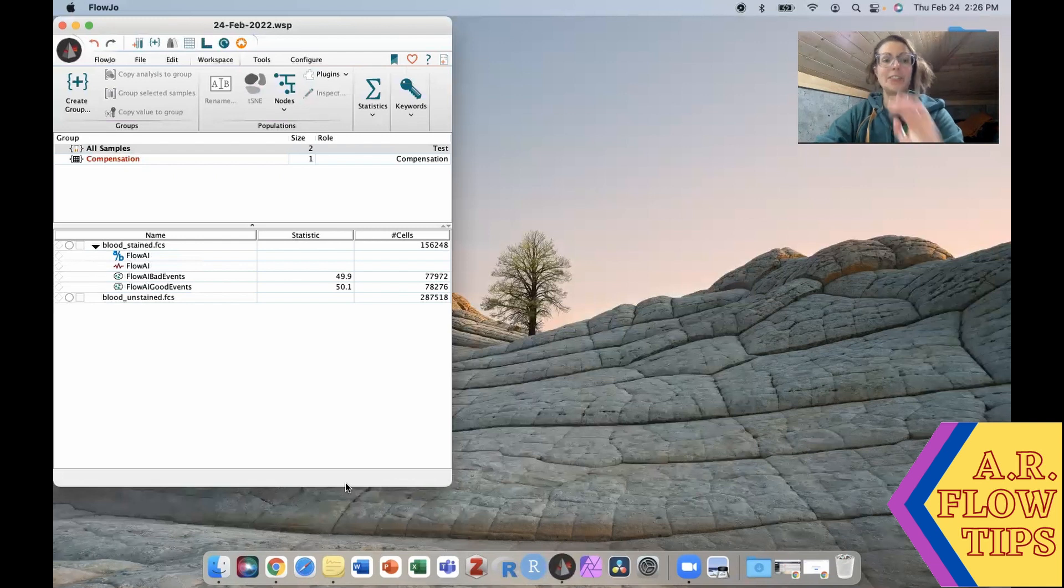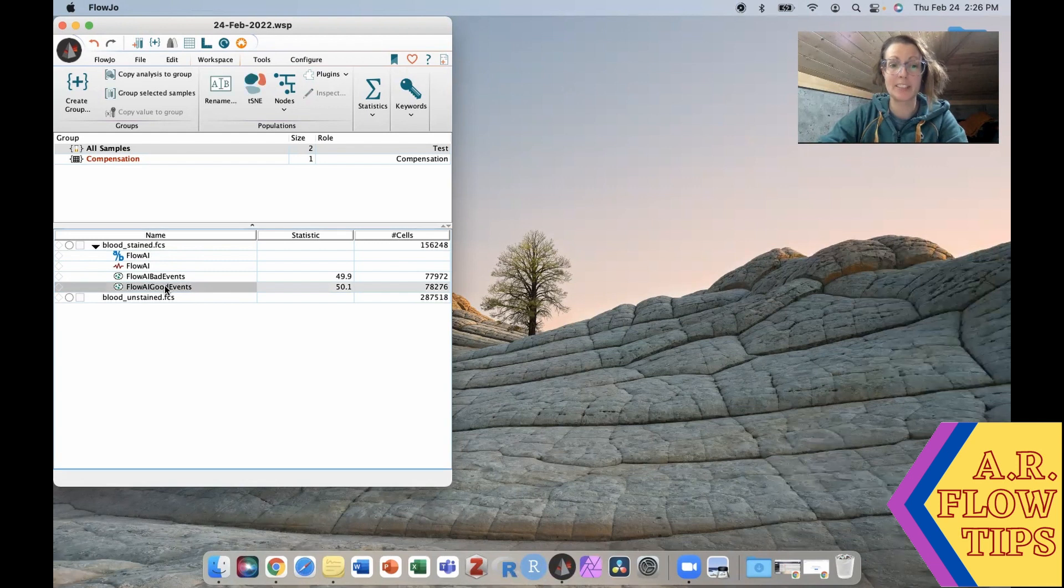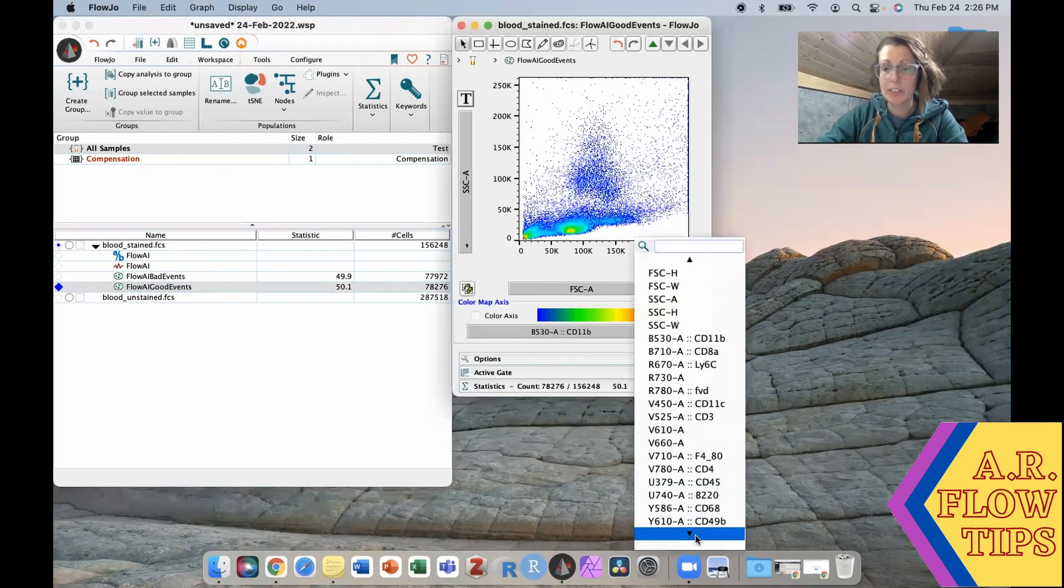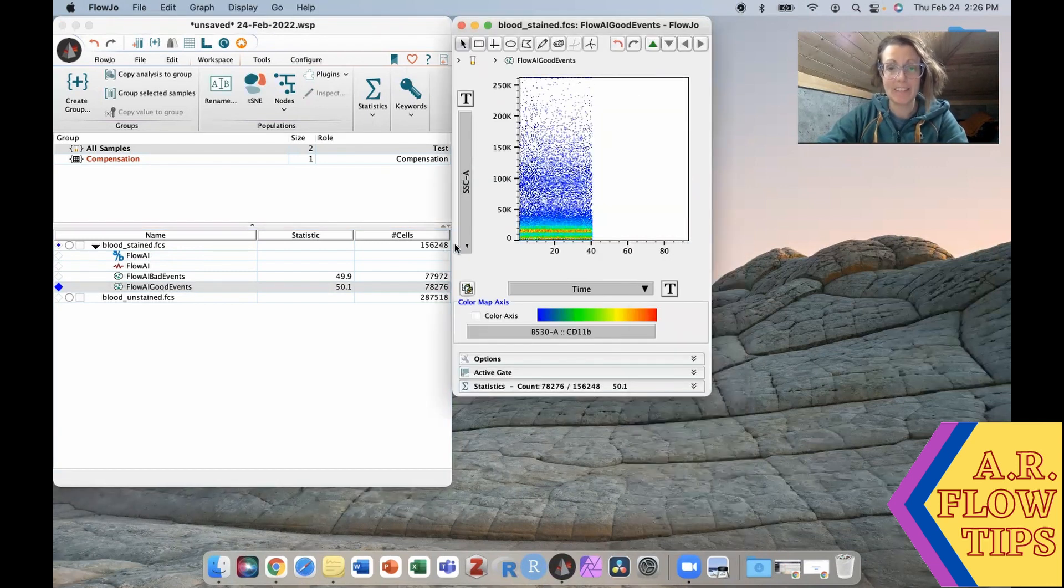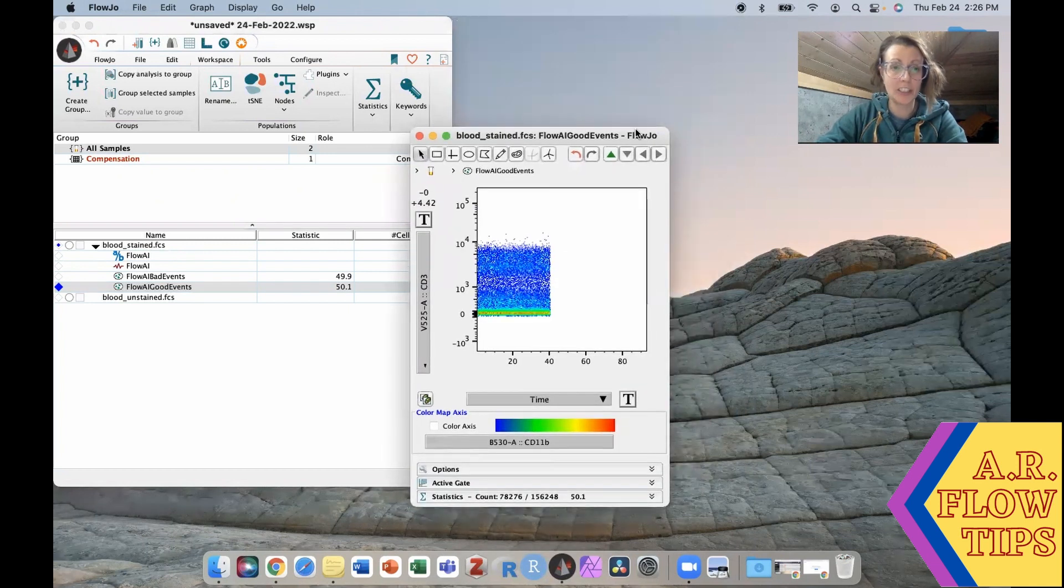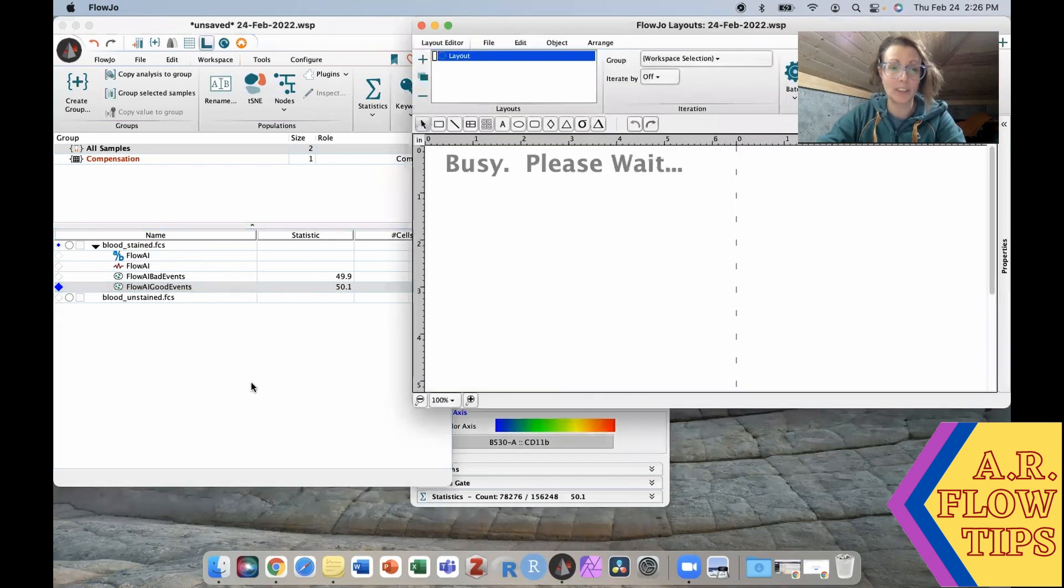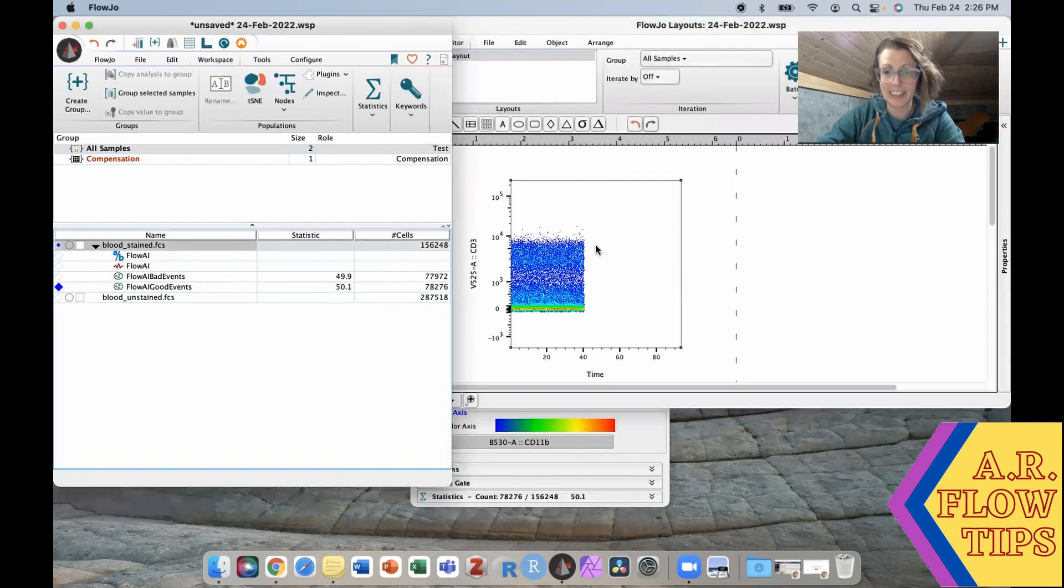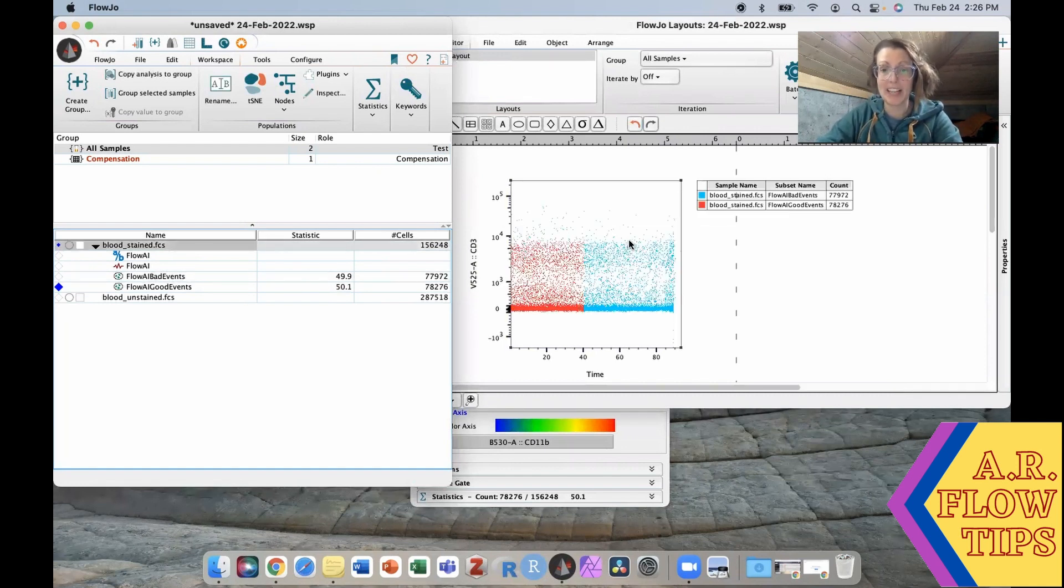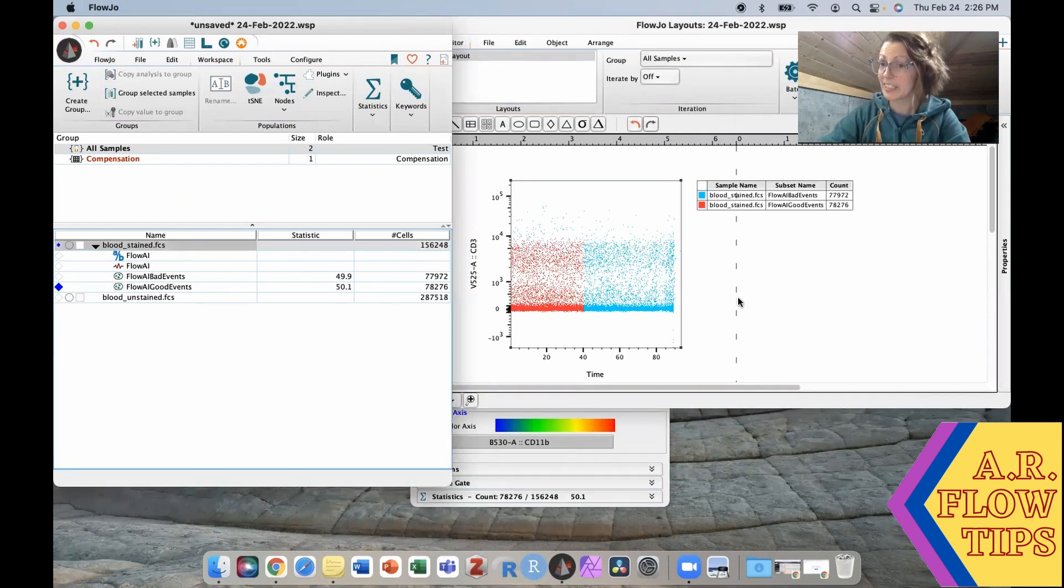All right so you can see up here it pulled up what it calls Flow AI good events and Flow AI bad events. So let's open this up and do the same thing we had before. We will do time versus CD3 and those are our good events. We can go ahead and open our layout editor, drag and drop that in there, and you can see it's actually pretty similar to what we pulled out in our time plot. Then if we throw in here our Flow AI bad events we're going to get basically the second half of our sample looked really terrible.